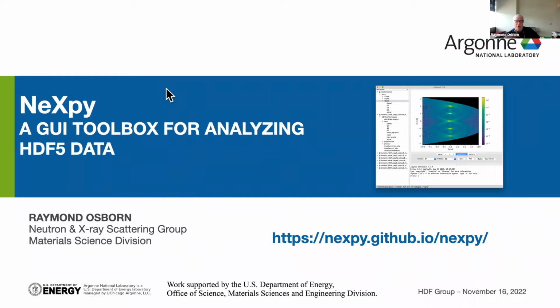And this is data where we don't have some standard process that will reduce it down to a reasonable size. We often have to look at the data in flexible ways in order to understand what on earth it means before then perhaps developing scripts to produce a final analysis. So we do actually have a standard workflow, but we don't have a standard way of analyzing the data. And NeXpy is designed to be a GUI toolbox that allows us to analyze it.